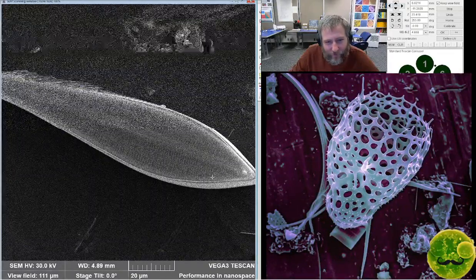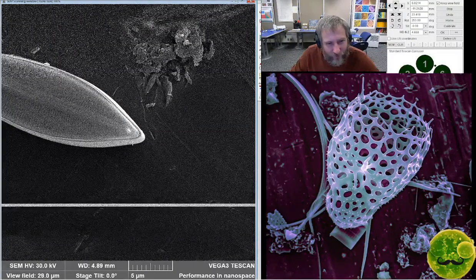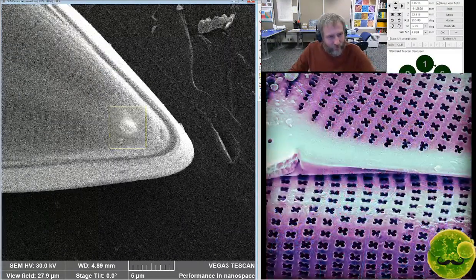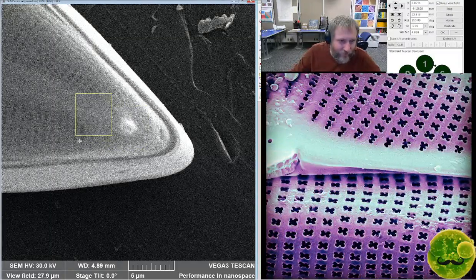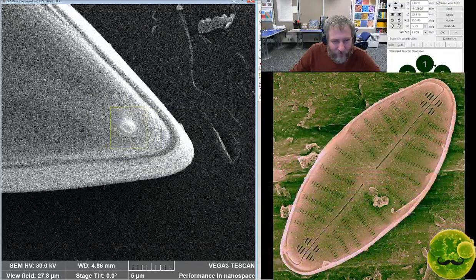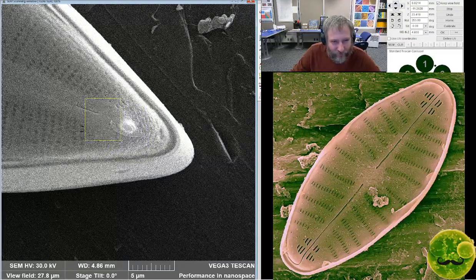And this is the horn. That unicorn horn that we saw. It's right there. This one only has one. The ones that we saw in East Africa had two little horns, but this one on each valve only has one. And it's really weird where it's positioned. There's the raphe, there's this horn, and it curls around the horn.